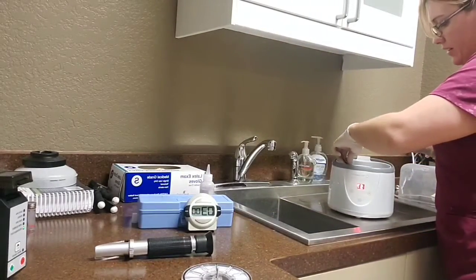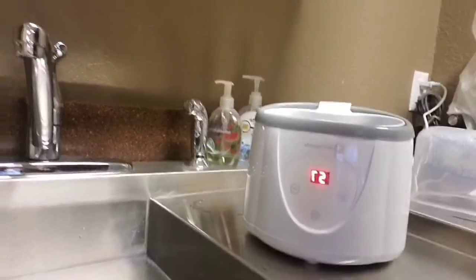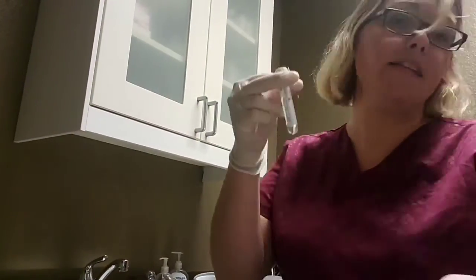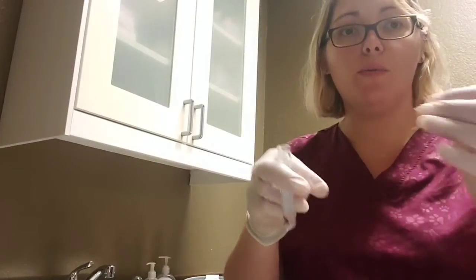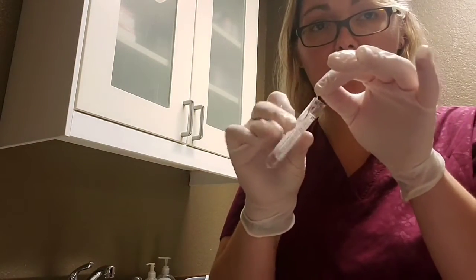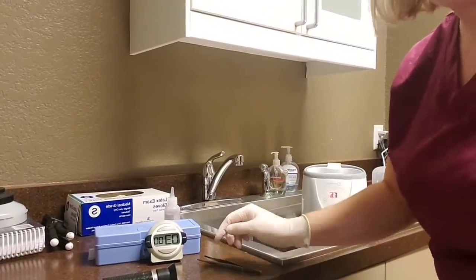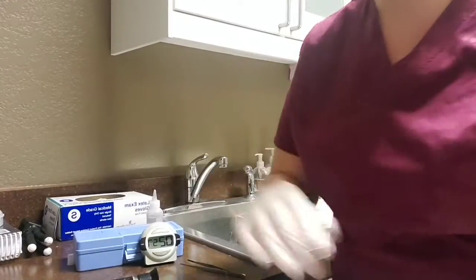I do have a tube in here, just a white top tube that has water in it that's been incubating. And just to show you, I think right now we're at 57, just a second ago it was 58, 59. I find that it's a little bit easier to fish out my tube when the time is up, as opposed to throwing the whole thing in the big water bath. So I'm going to toss this in here, plop my lid back on, throw it in my water bath, and set my timer for my 3 minutes and let that start.